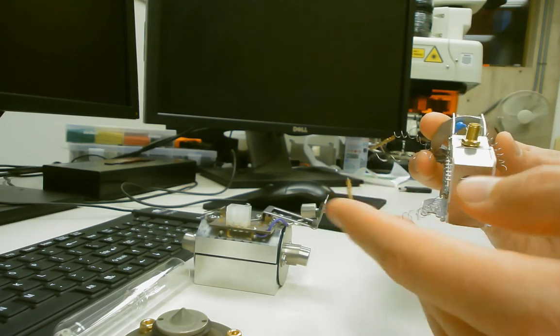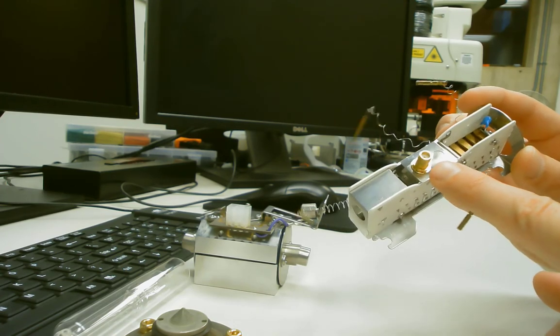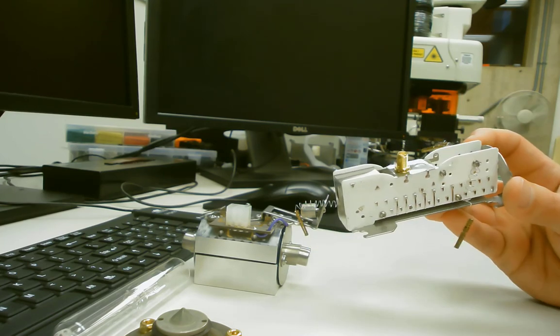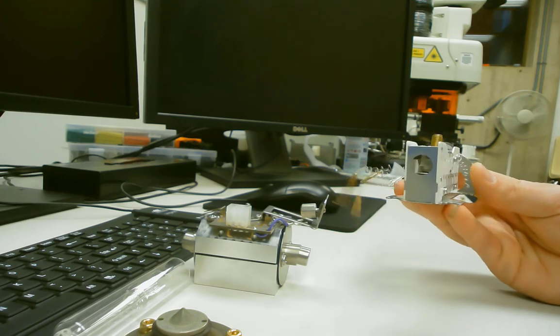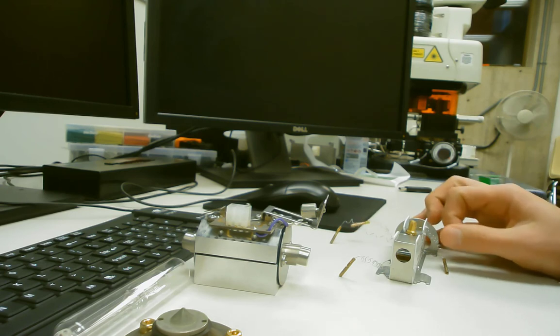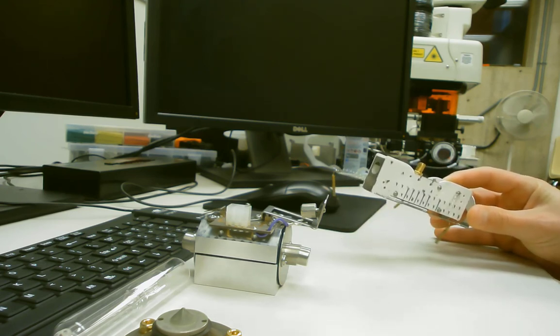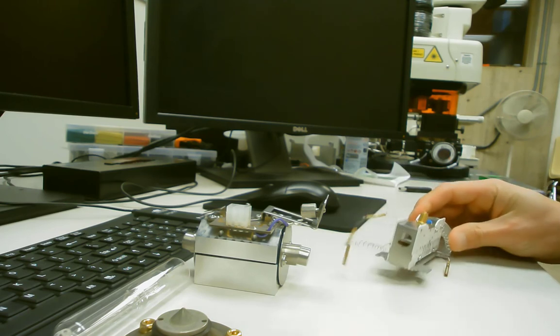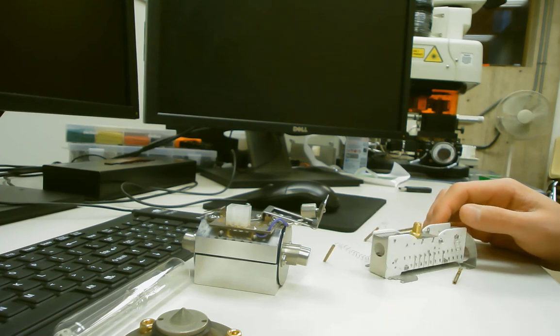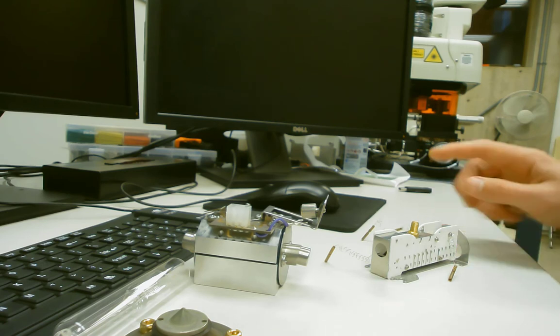Okay, all these little springy looking things are the different electrical contacts, as well as this one on top, which is a screw type coax attachment. This is where the counting of the ions is done and gives us our actual data. Electron multipliers have a finite lifetime, and so this one actually just outlived its time and had to be replaced. But it's nice that we can show it to you. It looks a little different than some electron multipliers you might see, which are more of that cornucopia shaped one that does the little spiral.